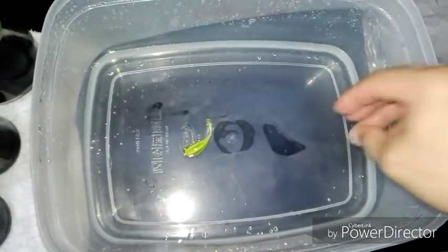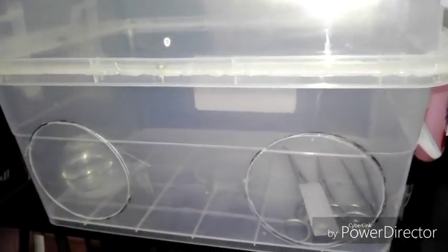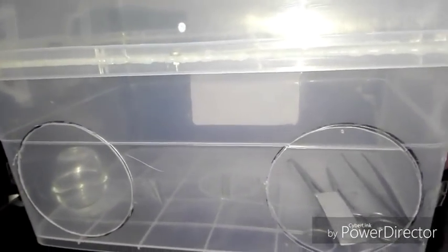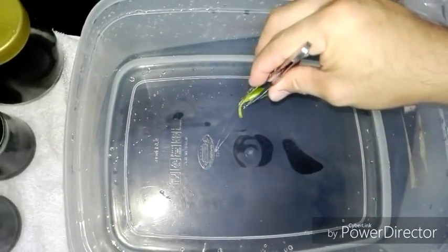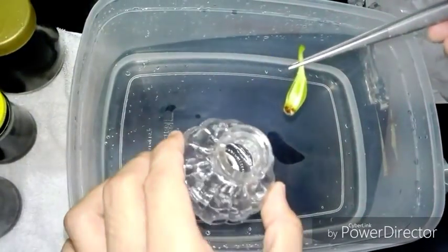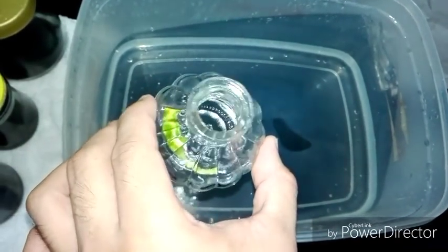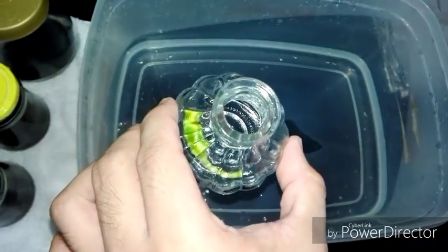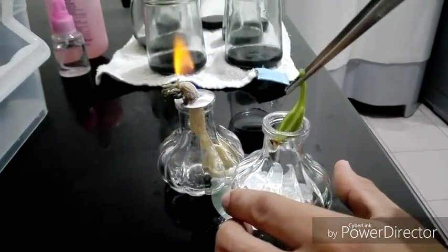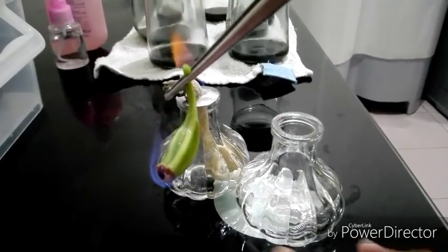Then soak it in a bleach solution for another two minutes. This is my homemade glove box that I am using for sowing orchid seeds. After soaking in bleach solution, soak the seed pad in 70% alcohol, and start flaming your seed pad four times in an alcohol lamp.